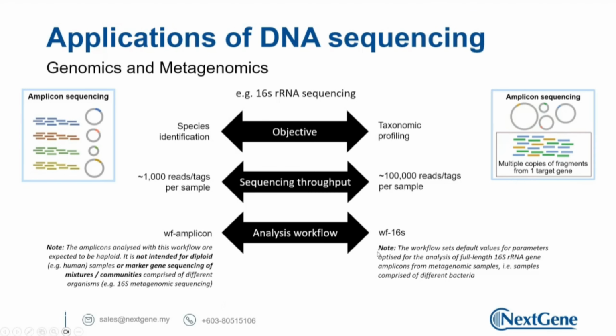Of course, with different sequencing approaches or different applications, we will require different analysis pipelines to help us interpret the data. For genomic amplicon sequencing, Oxford Nanopore has developed a specialized pipeline. The pipeline is named wf-amplicon.